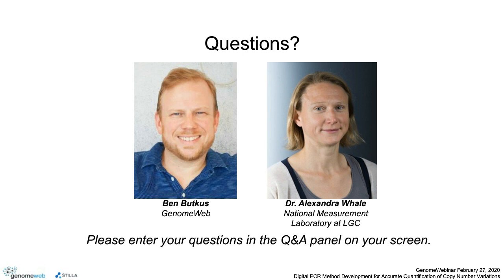Thank you. The next question, how long is the runtime of digital PCR versus qPCR? So the main difference is that partitioning. You can set up digital PCR reactions in 96 well plates, in 8 well strip tubes, and then you have to have this partitioning step. Now, each of those commercial platforms has a different way of performing that partitioning.